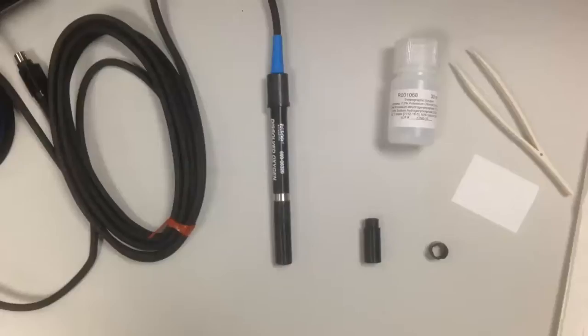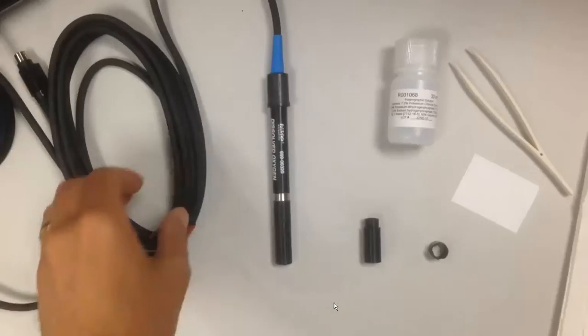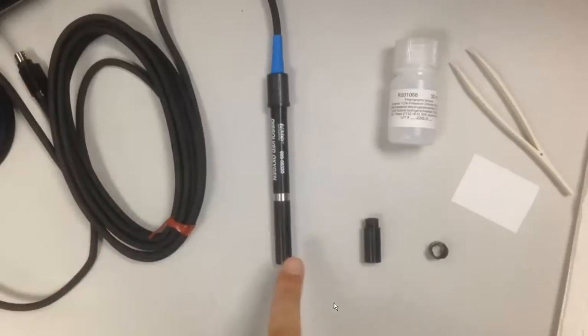This is a video showing the changing of the heads for the polarographic solution type dissolved oxygen sensor. So I have laid out here all the materials that we'll need.